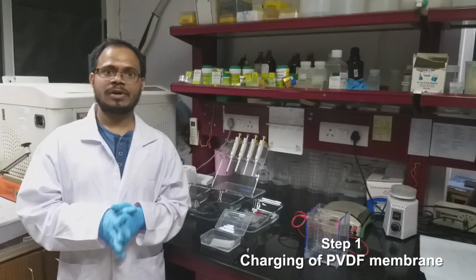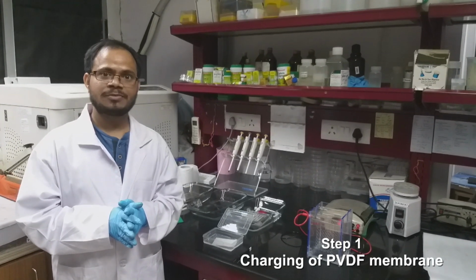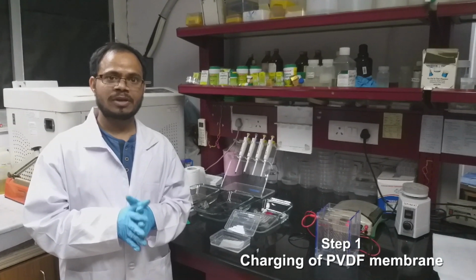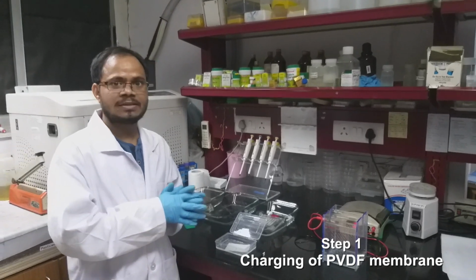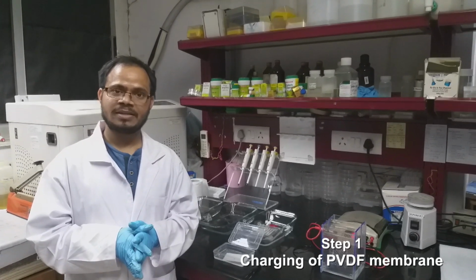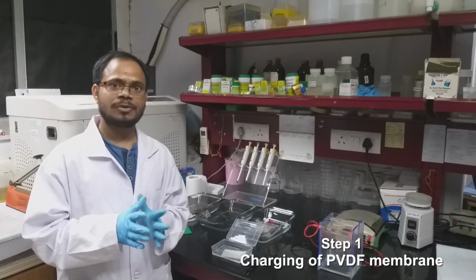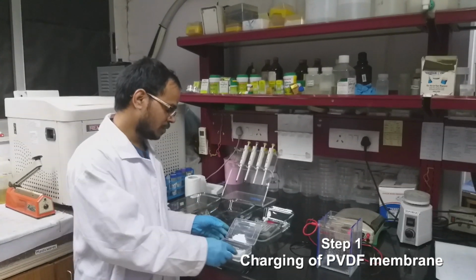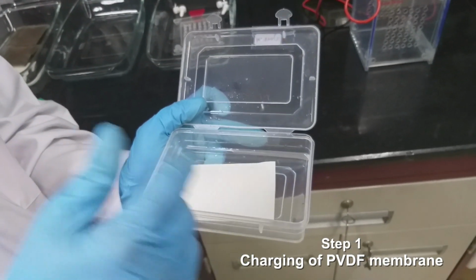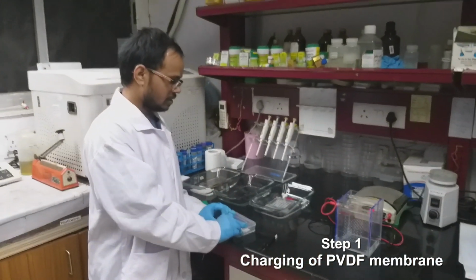If you want to use PVDF membrane, you have to charge it with methanol. Since PVDF is a hydrophobic membrane, you cannot directly transfer in the aqueous medium. First you have to keep it in methanol for at least 20 minutes. This can be called charging. After this, we will use it for transfer. So it is pre-soaked in methanol and equilibrated in transfer buffer.